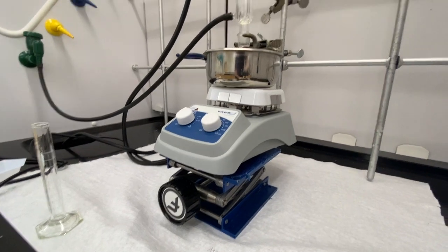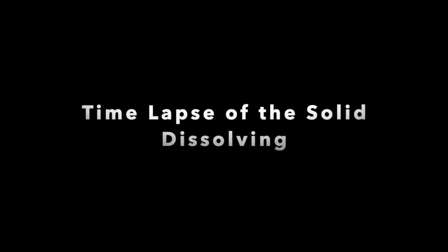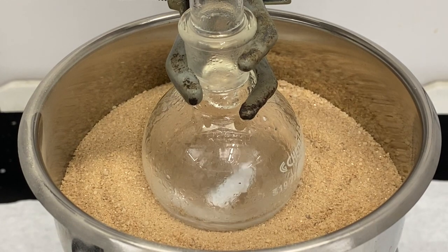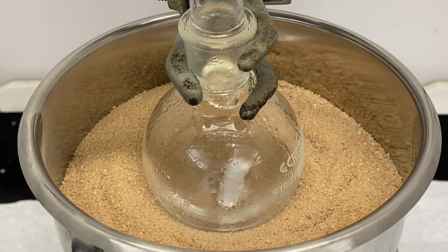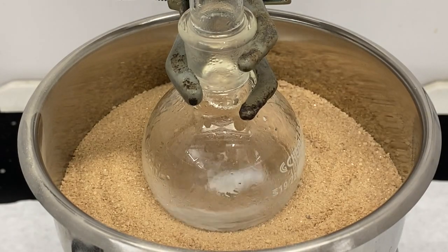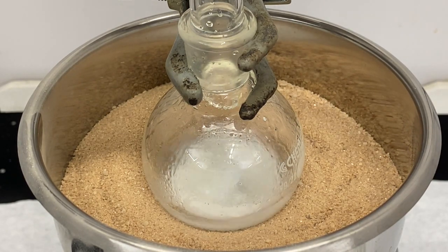We're going to leave this to heat for a little while until the solid in the reaction mostly dissolves. At this point most of the solid has dissolved — not perfect, but good enough. So I'm going to leave the camera focused on the flask because that's where all the action is going to be. I'm going to be pouring 1.2 mL of HBr through the top of the reflux condenser, so it'll just run down the condenser into the flask. You should see something happening.